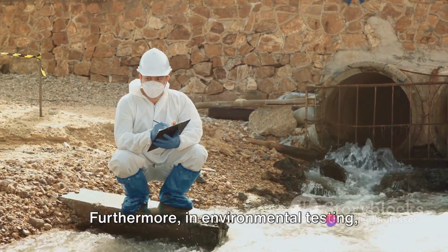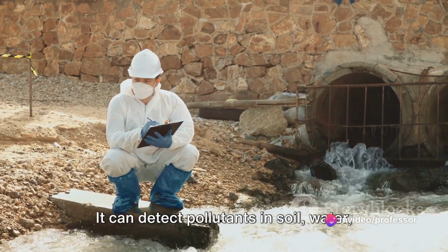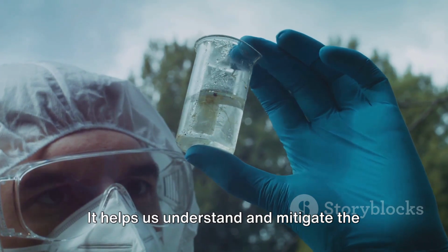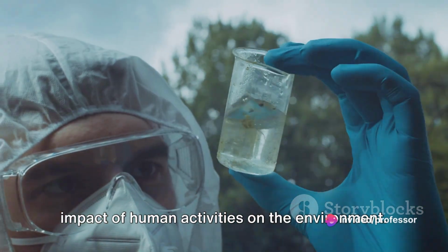Furthermore, in environmental testing, HPTLC helps monitor the health of our planet. It can detect pollutants in soil, water, and air, providing valuable data for environmental conservation efforts. It helps us understand and mitigate the impact of human activities on the environment.